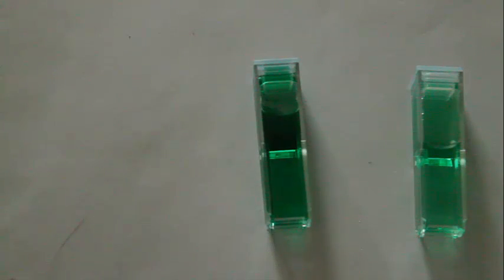In the last part of this demonstration I want to take advantage of these cuvettes which have a nice little feature. One side is thick, around one centimeter thick, and then we can rotate on its side and see that it's only about three millimeters thick. What this allows us to do is shine the light through either a large amount of the sample or a small amount of the sample.